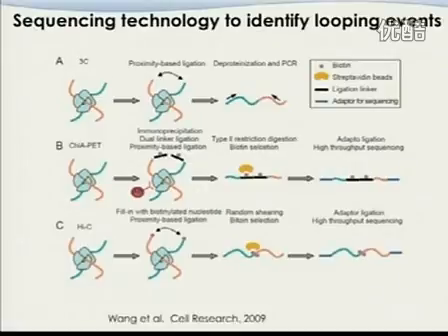Just a brief summary of what we discussed. The first story is RNA polymerase, and you can see that using that information we can study microRNA, or we can study other types of transcription regulation. The second one is the histone markers. There are not too many methodologies that have been developed, but we do have one methodology that identifies the enriched regions. It's not a peak finder, because histones don't work in that way, but rather it finds the enriched regions.